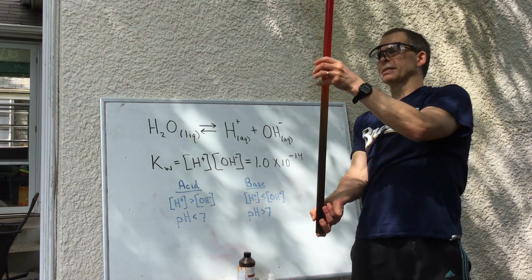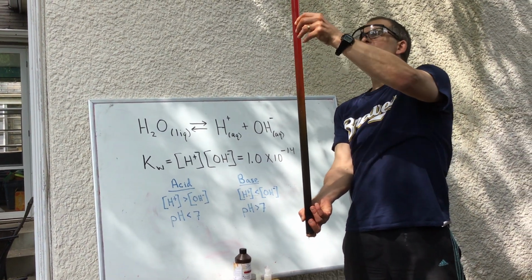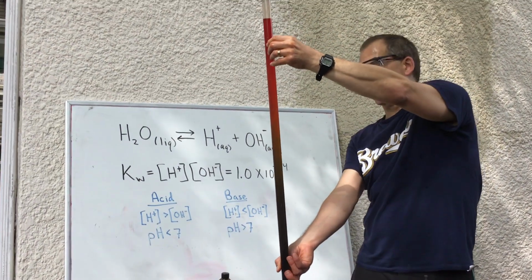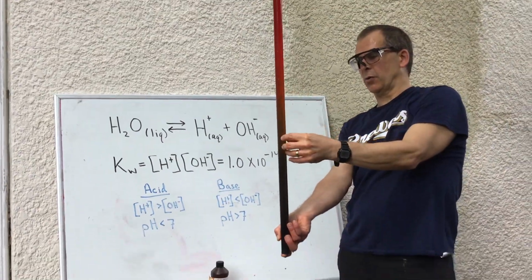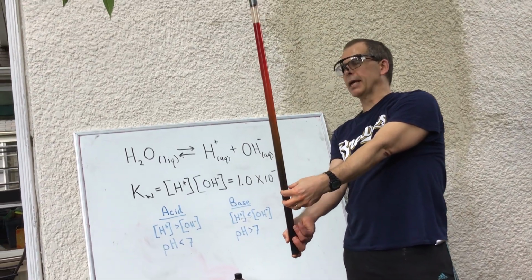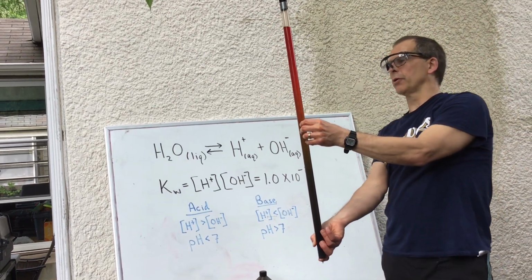And what's happening as they intermix, you're going up pH of 6, 5, 4, 3, probably around a 3 or a 2 right here. Not too acidic and very dilute, so if I'm getting this on my hands, I'm not worried about that. Same thing with the base right here. I'm at 7, and then as I go down, 8, 9, 10, maybe about 12 right here, pH with these dilute solutions. In case it leaks, I'm not worried about that, but we can see this different coloring.